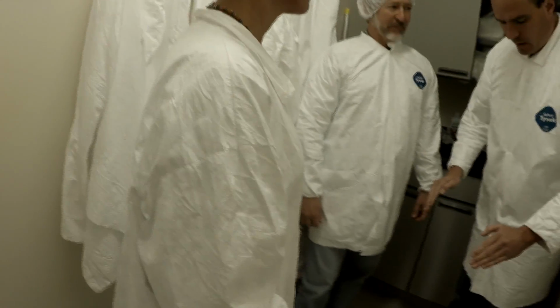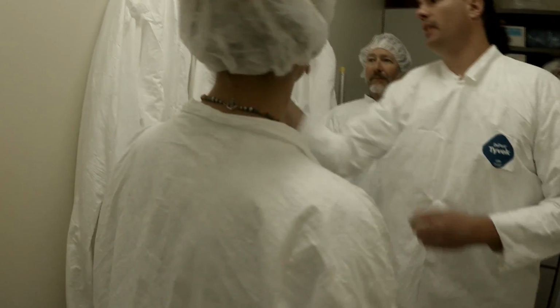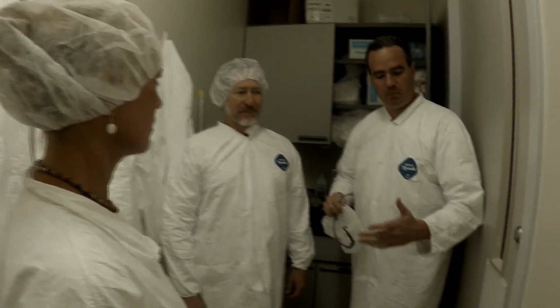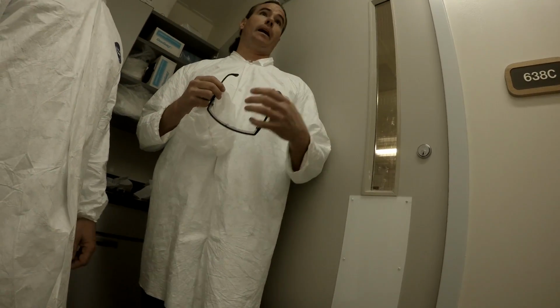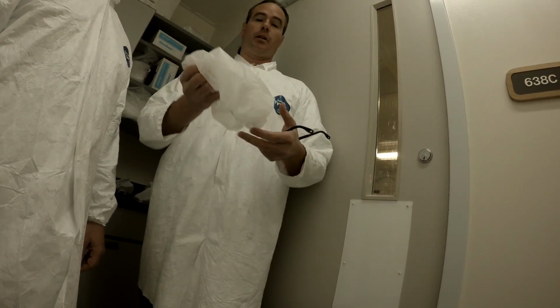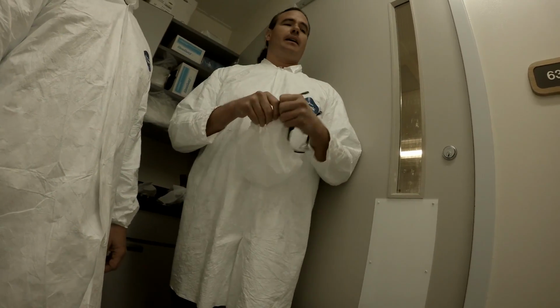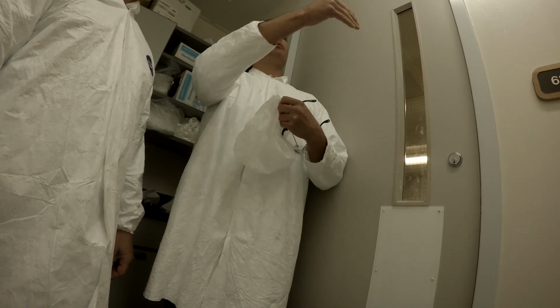We are gowned up. The shoes are off. We have footwear that's worn only in this lab, because obviously the bottoms of your feet and your shoes are very dirty. The simple fact is we are covered up as much as possible because once we go inside, we are going to be the dirtiest things in the lab. We're going to be dirtier than the floor. We're going to be dirtier than the counters. And so as we come into the clean lab, we try and make things progressively cleaner.